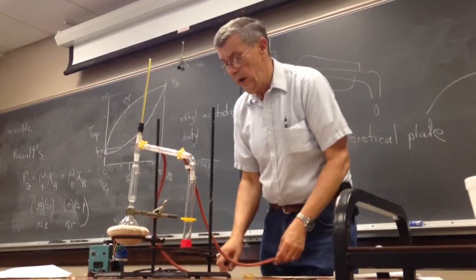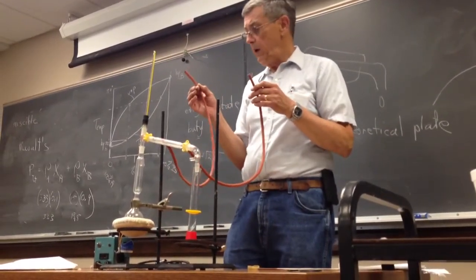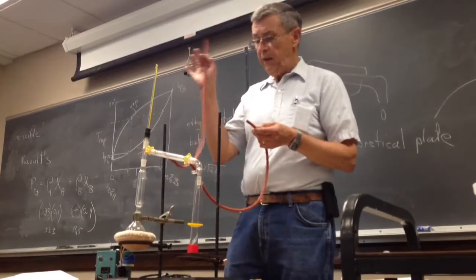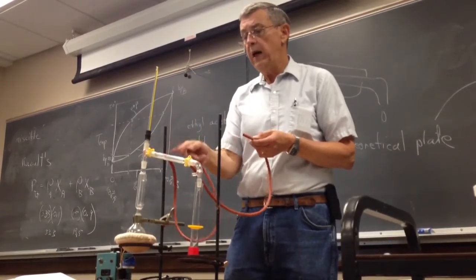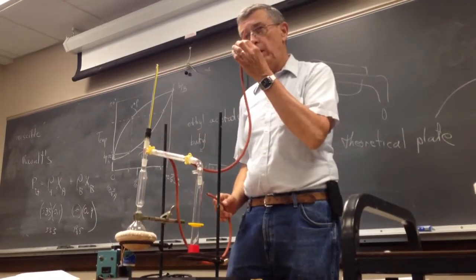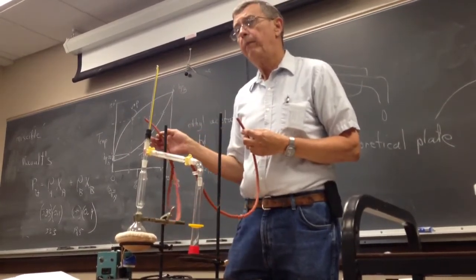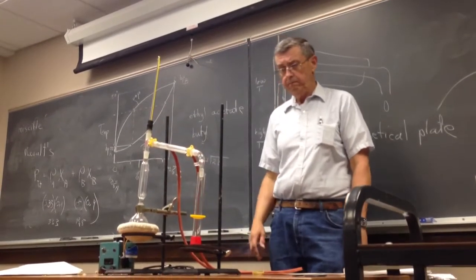Okay, so there I am, and then I just have to decide, well, one of these is going to go to my lab partner's hip pocket, the other one's going to go to the faucet, which is which. If this went to the faucet, I'd create a waterfall. It would be cute, but it would not fill this with water necessarily. So the bottom one goes to the faucet. So for a condenser, water always goes in the bottom, out the top. So that's set up fine.